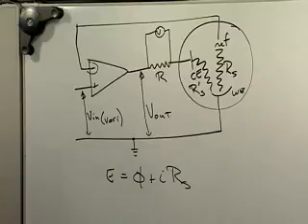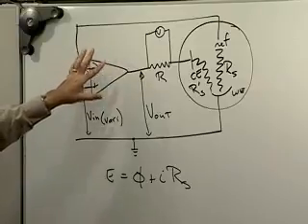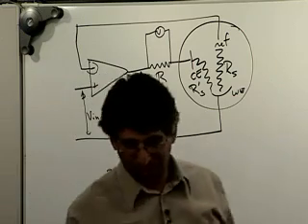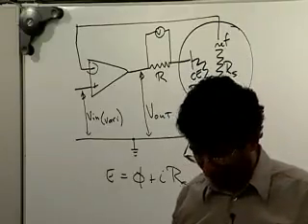Okay? Why not? Real-life potentiostats usually have at least 2, often 3 stages of operational amplifiers so that they can get into this region of fine potential control. And if you use a single op amp like I've drawn here, then you will not be able to hold your potential. So conceptually, this is the right circuit, but in fact, you've got to do a fair amount of engineering to make this circuit work, and there's usually a series of stages of amplification that allow you to hold the potential.